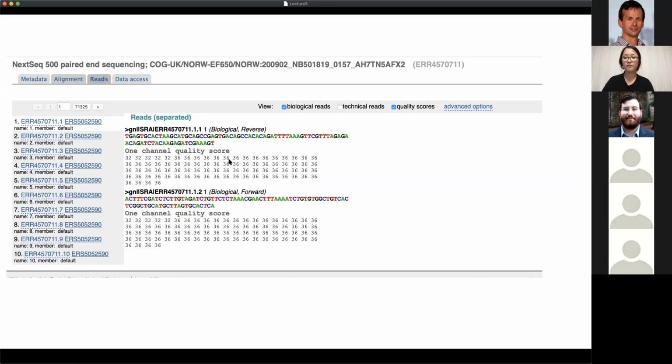So this is what a raw output from a meta-transcriptomic analysis like the one done in the Nature paper would look like. Millions upon millions of short reads, which are on their own obviously completely useless. You can't interpret them in any way other than to say I have some sequence data and it looks okay to me.